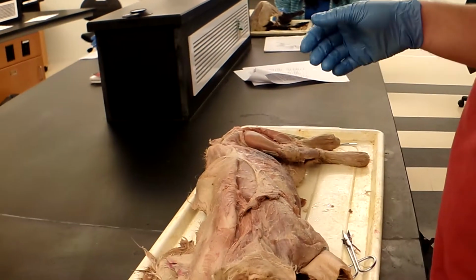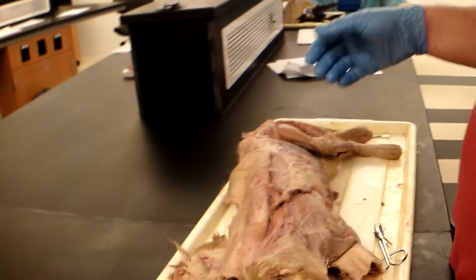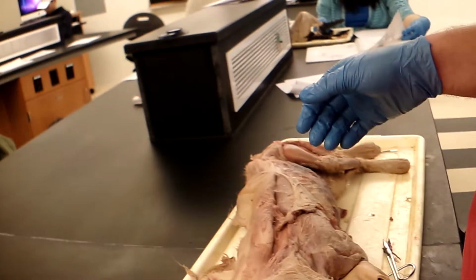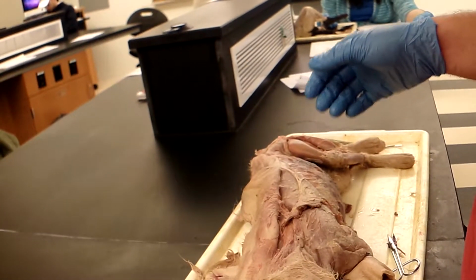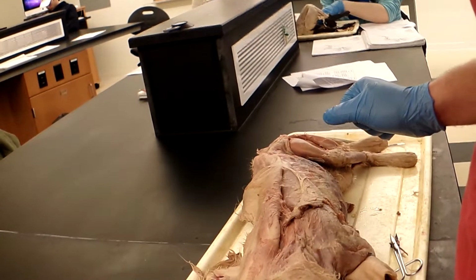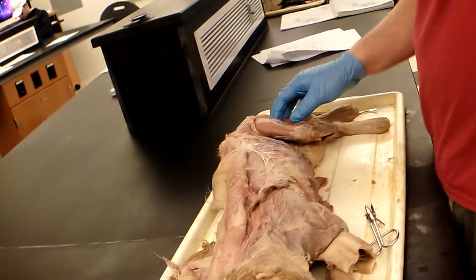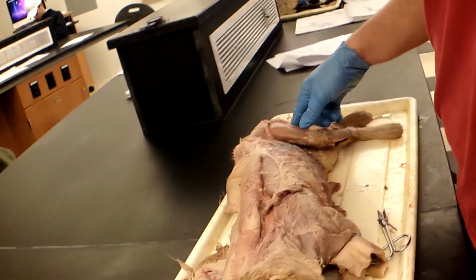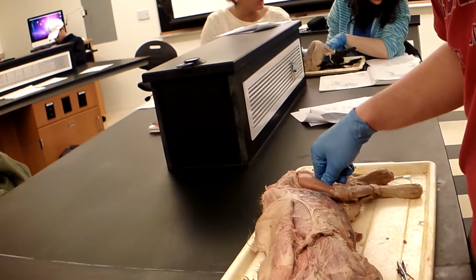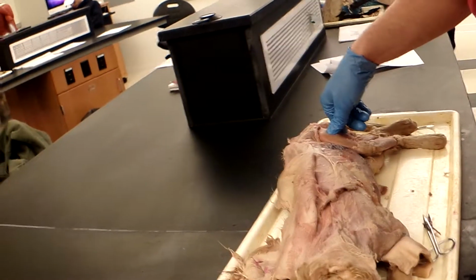Next is the semimembranosus, which is located right next to the semitendinosus, also right back here. The origin is the ischium, the insertion is the femur and tibia, and the function is that it extends the thigh.